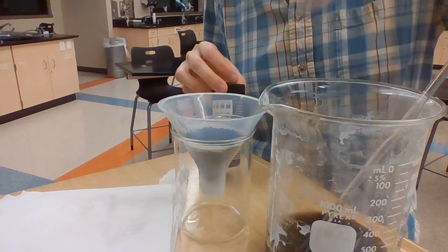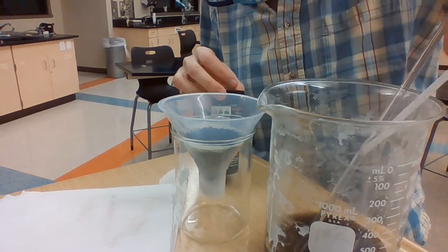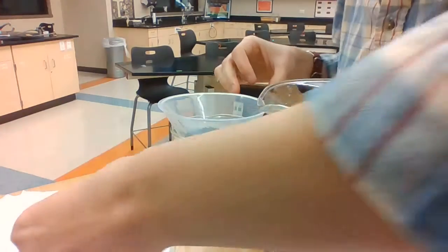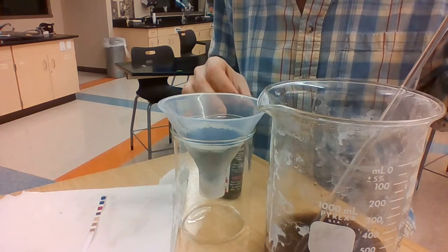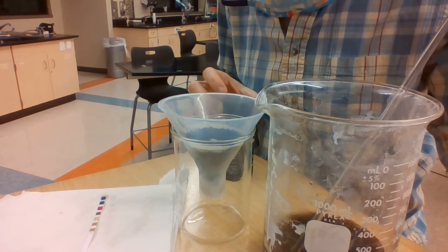Okay, so I'm just going to take this, dip it all the way in, shake it a little, and then let it sit for about 30 seconds. Then I will start the video again and show you the results.